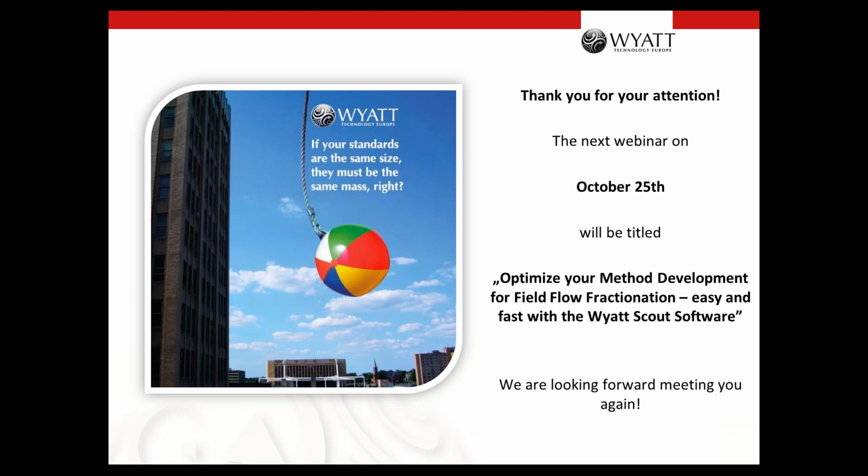Thank you. The next question: with MALS, do we need refractive index data of a particle? That depends. If you have it, it would be optimal, because that would mean a real concentration measurement in milligram per milliliter with DRI, and it allows you also to measure the molar mass. But usually with particles you are not interested in molar mass, but more in the size and in the amount of particles.